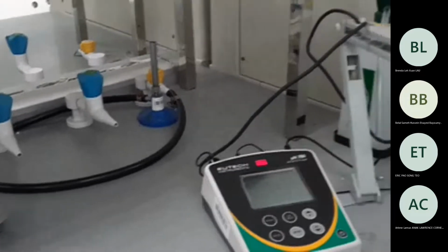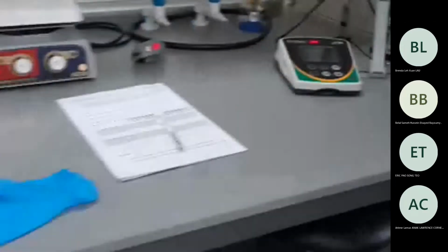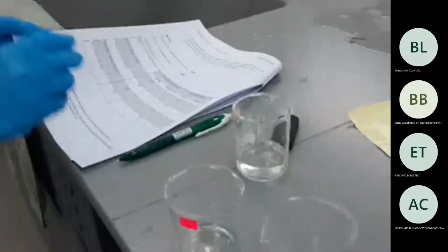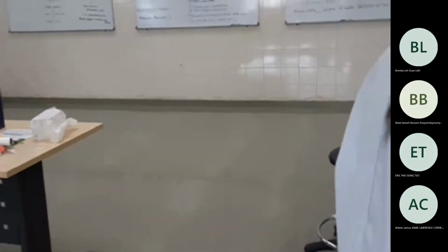Okay, so you need to take these 2 beakers, right? You can just discard the water and take 25 milliliter. Noor, have you taken 25 milliliter in all 4 beakers? Okay. So if you have taken water in all 4 beakers, you don't need to bring the 0.1 molar sodium hydroxide and sodium acetate here.